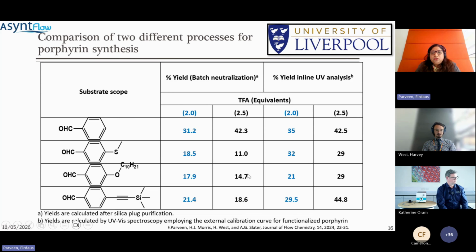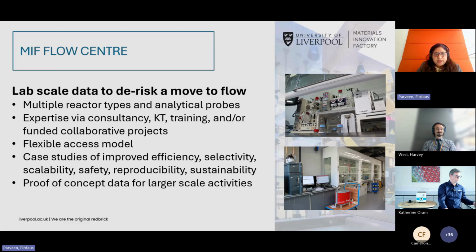So to further improve this process, we suggest we should add an inline purification method, so that we can further improve the system, and further adding multiple data collection at multiple points in the reactor would be essential if we want to fully understand the process. That will be covered by my colleague Harvey in his slides.